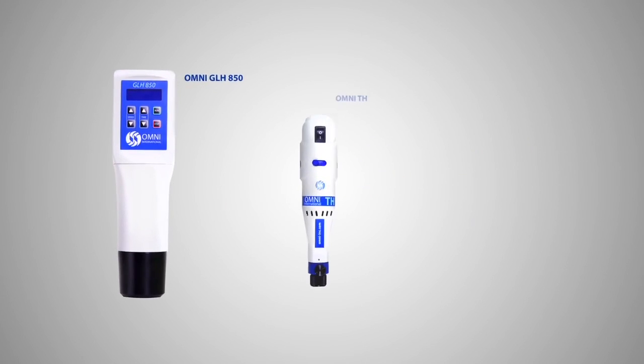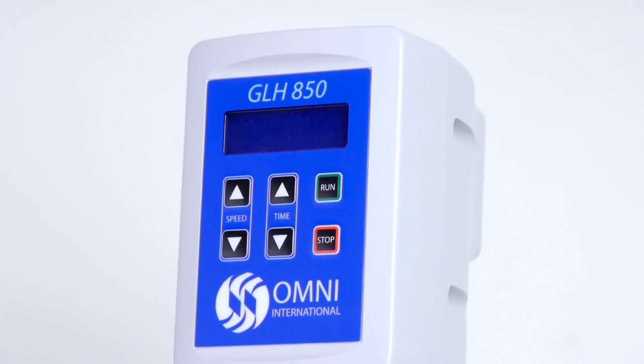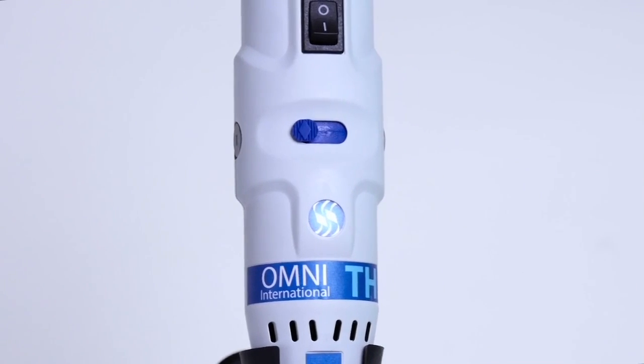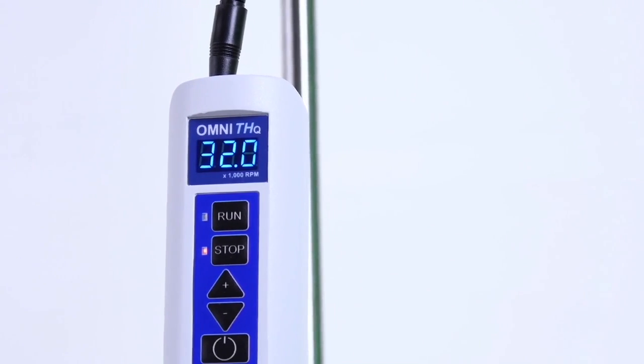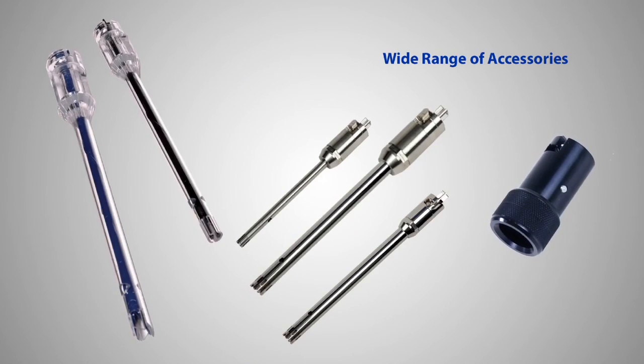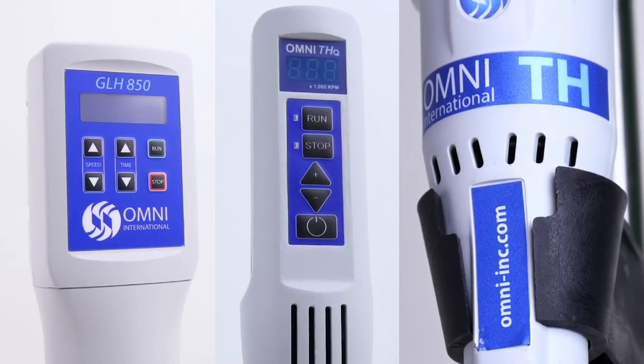Omni Rotor Stator homogenizers are engineered and built in the USA, ensuring ultimate quality and reliability. With versatile options ranging from 150 to 850 watts of power, digital controls, and a wide range of accessories, Omni Rotor Stator homogenizers are a perfect fit for any laboratory environment.